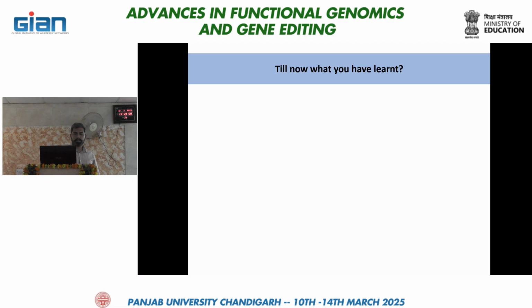So with this, I think you have learned today how to select an appropriate vector for your study and from where you can get the vector and how you can retrieve and select a target gene. That depends on your study, and basically I have demonstrated how you can retrieve the CDS from NCBI and you can similarly retrieve it from any other database specific for your organism and work.